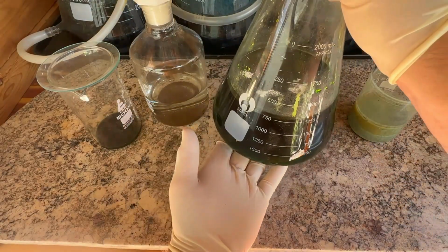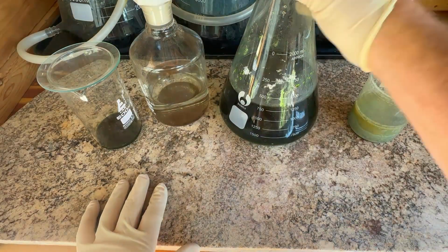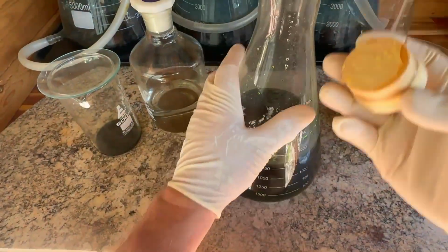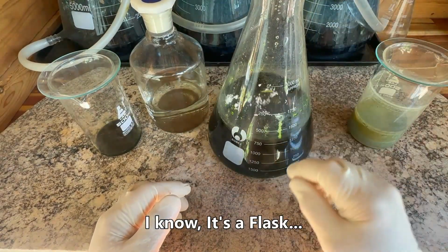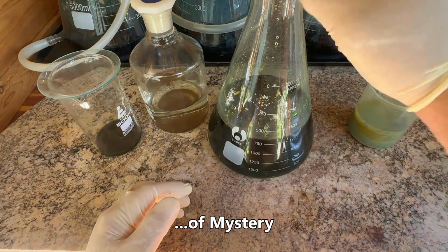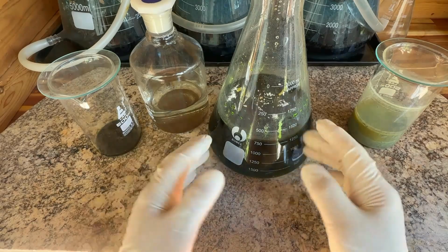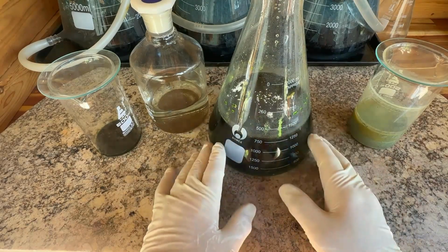Today we're going to continue refining my leftover solutions, particularly this one here, the one I like to refer to as the beaker of mystery. It's destroyed a stopper. It contains, I know, leftovers from washes of a gold-filled refine. In addition, the super concentrated waste solutions from probably 50 or 60 other refines, thus the beaker of mystery.